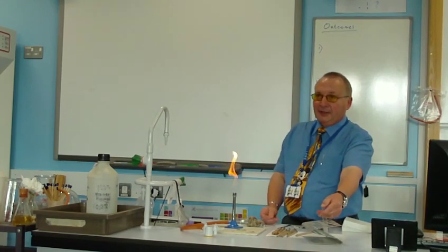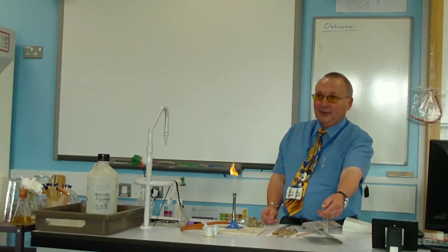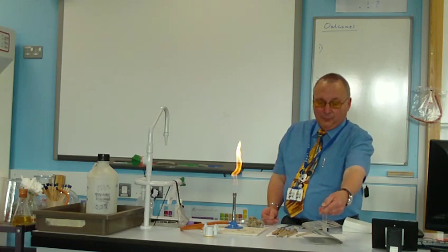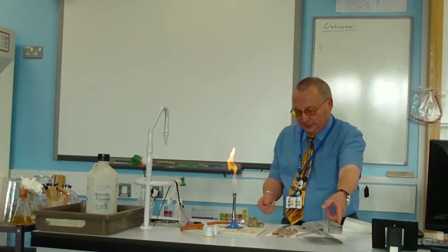How long did we wait, did we say, Lucy? About 2 minutes. I was going to ask how many times it would work with the pop test. Well, you wait about 2 to 3 minutes. You should feel a little bit of pressure under your thumb if you wait about 3 minutes.